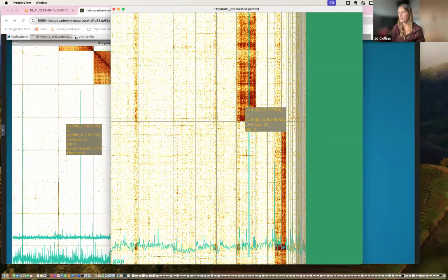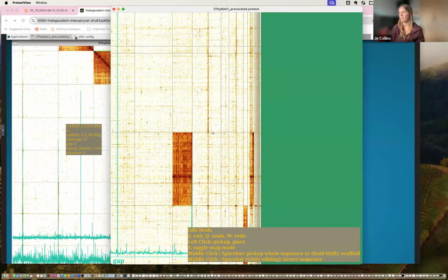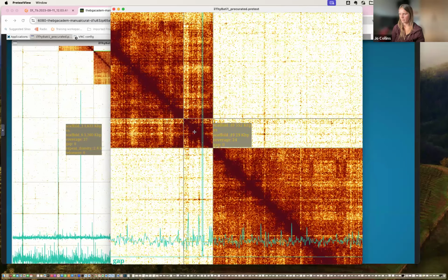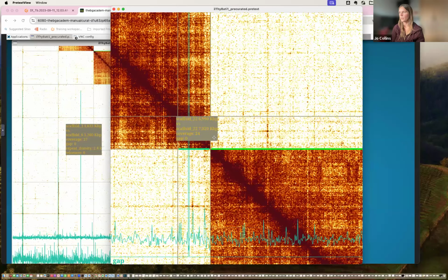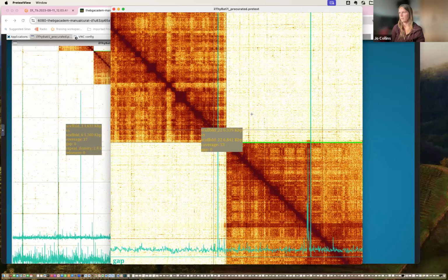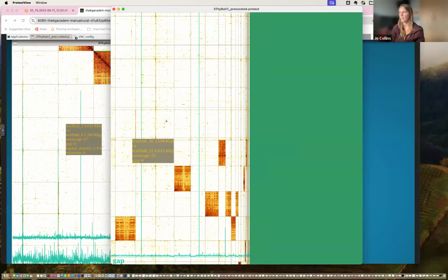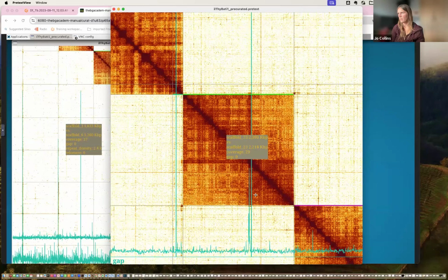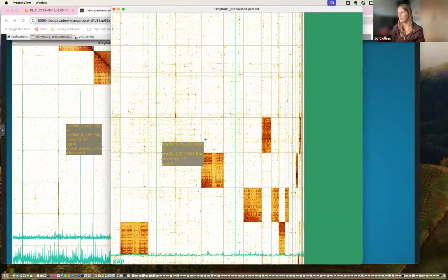Again, we've got a piece that goes in, we've got a very strong signal at the end of this scaffold. We move that in, we can see straight away that we need to put that back on, straight away that we need to flip this to make our join. I'm sorry, I should just go back and check, that's that. And then through here, looks okay, it's 2 there, that's okay.